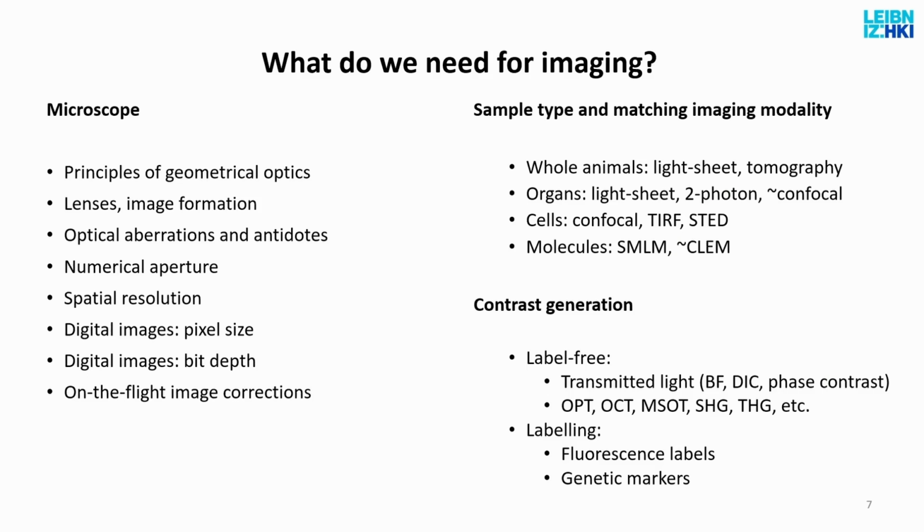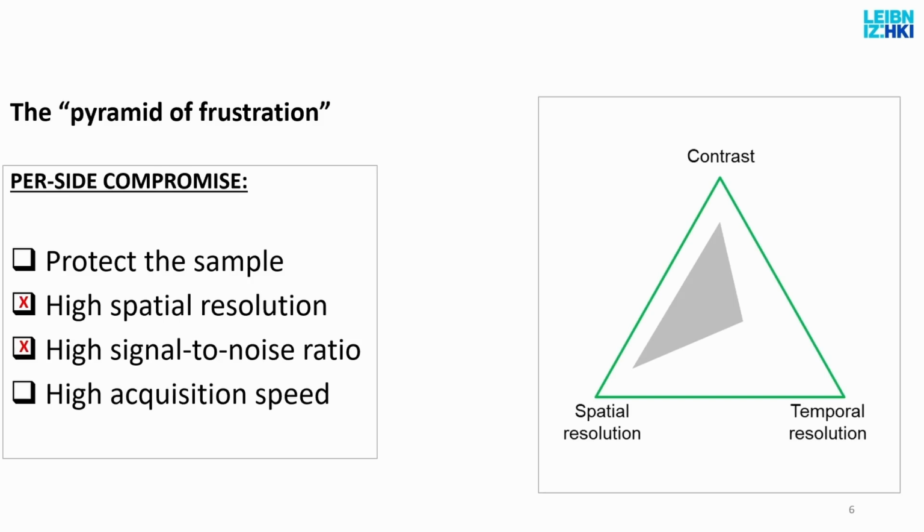Now, with the advent of AI and AI-based image analysis models and tools, the requirement on the signal to noise ratio has been eased a lot because I can afterwards train a model that learns on high resolution, high signal to noise ratio images.